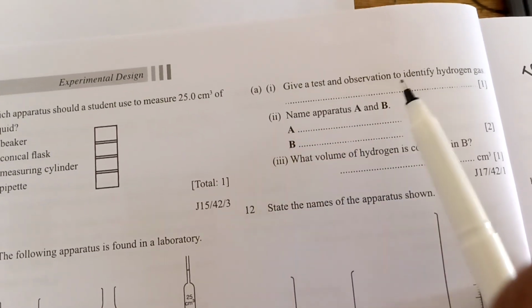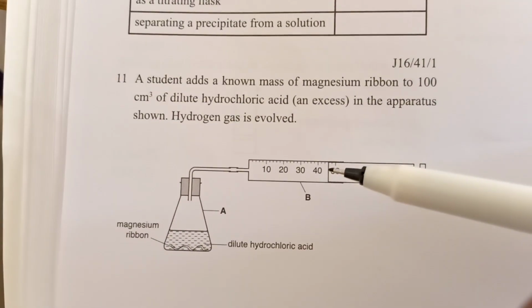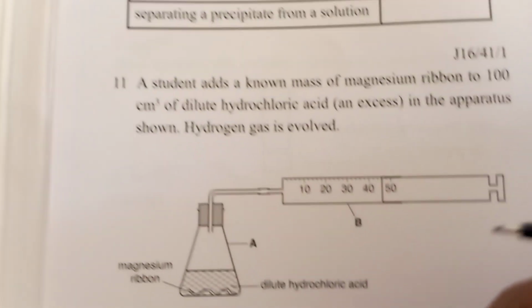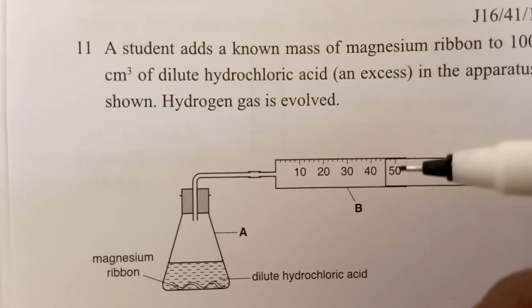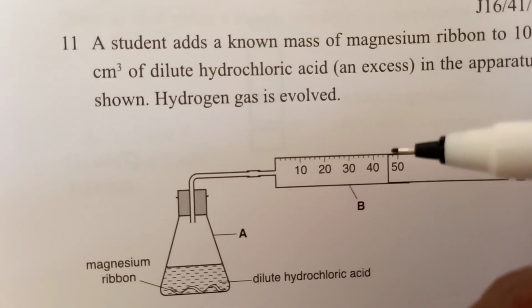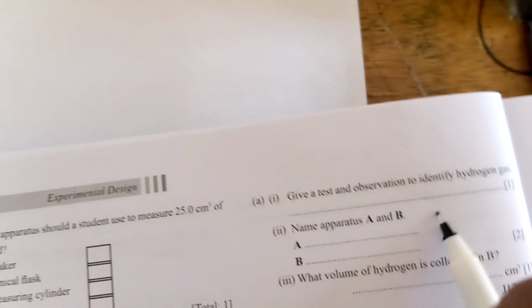Name the apparatus A and B: conical flask, gas syringe. What volume of hydrogen is collected in B? You have to read this volume. It is 46 centimeter cube.